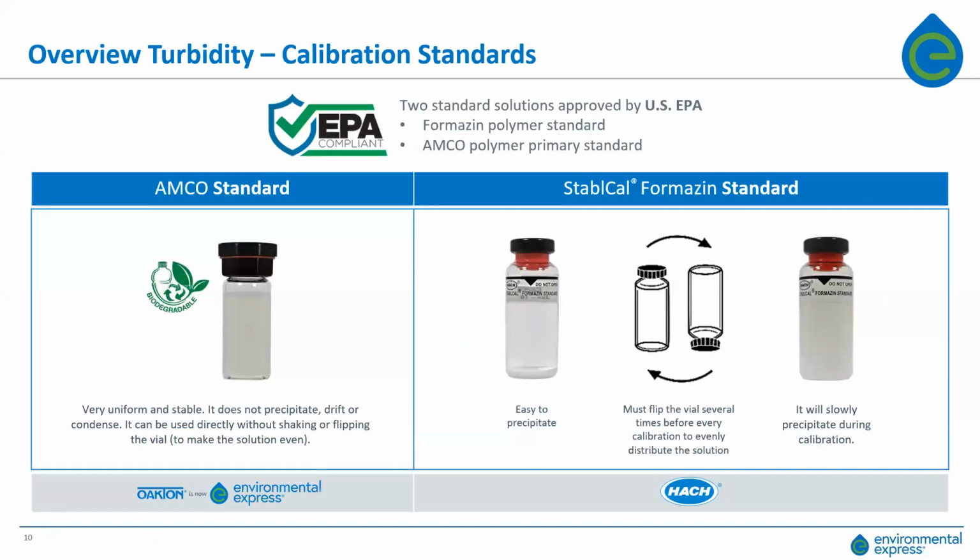Next, I'd like to talk quickly about, well, I'll make one final statement about the enhanced performance possible with these light sources has led to an immense improvement in stability, accuracy, and repeatability of the turbidimeter readings. The instrumentation with built-in software that complements quality assurance and quality control requirements can improve the operating integrity and boost the end user confidence in the turbidimeter readings.